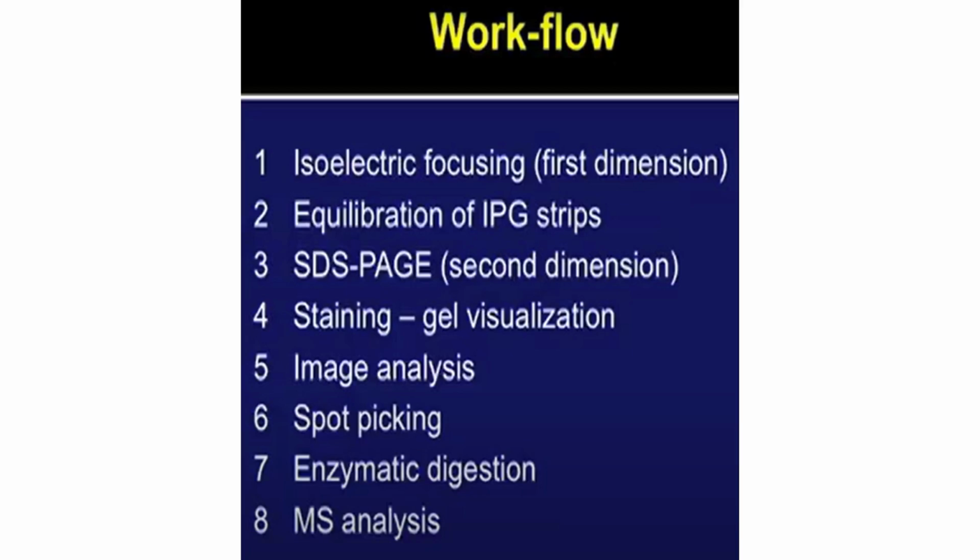Those specific spots will be cut and enzymatic digestion of that specific spot is done. Then that is the purified protein itself.